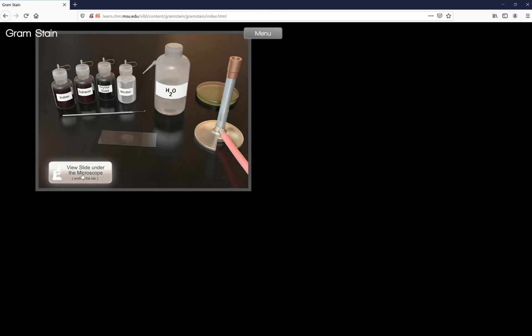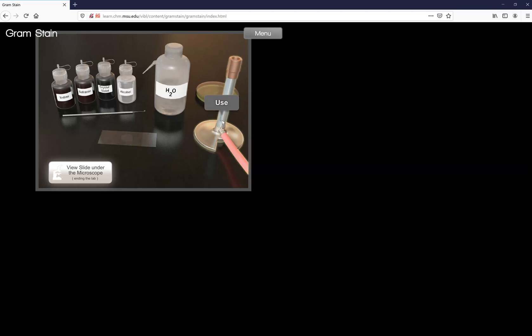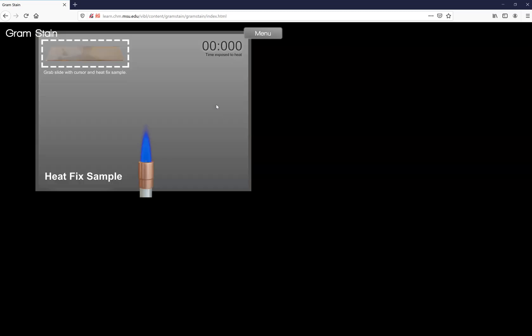Your job is not to view the slide. That's the last step right there. You need to pick up your slide and you need to pass it through the flame. So it doesn't let you click on the slide. So your first step is to heat fix. So use your Bunsen burner.